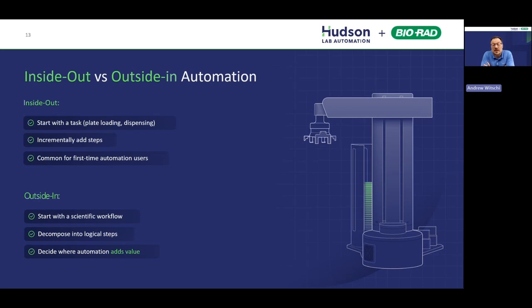Bottoms down, or sorry, top down automation, or outside in would be where you look at that main workflow that was on the prior one. You start breaking it up into chunks, right? Because that already kind of had some of the work done by being broken down into high-level module steps. And then you really decompose that down. And once you get to those more granular views on things, that's when you start looking at hardware.